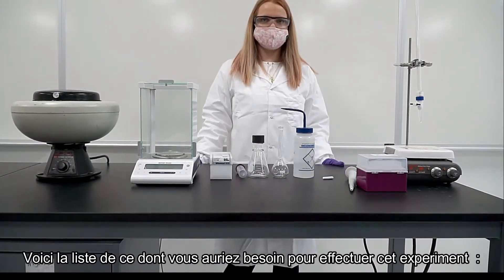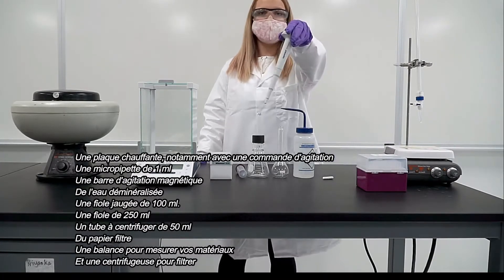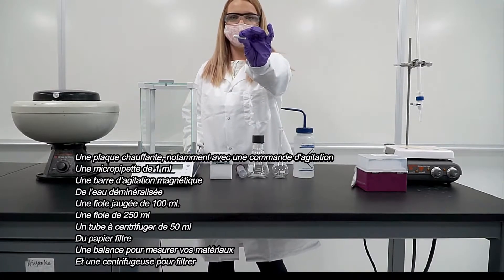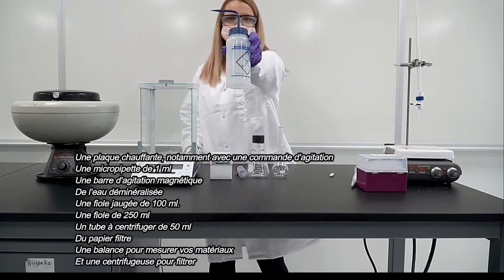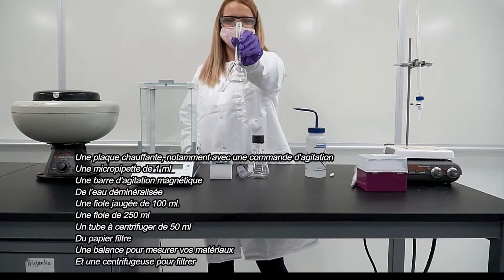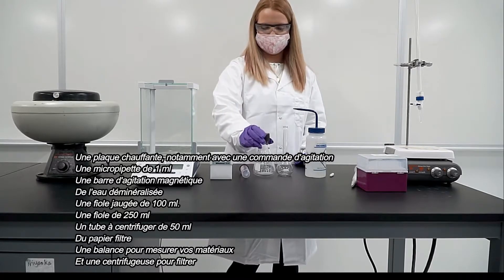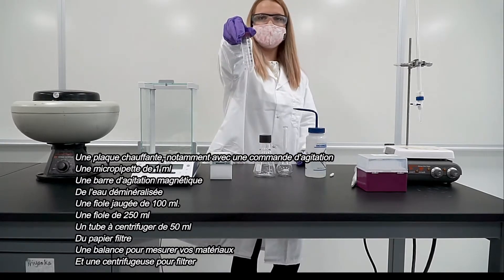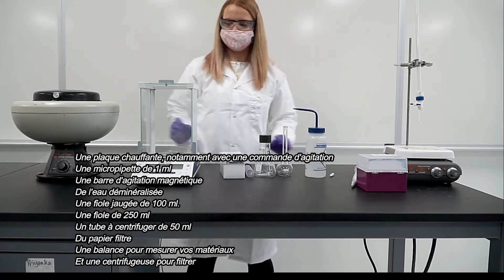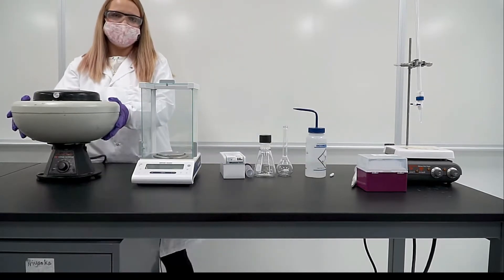Here are some of the supplies that you will need: a hot plate specifically with stir control, a 1 milliliter micro pipette, a magnetic stirring bar, DI water, a 100 milliliter volumetric flask, a 250 milliliter flask, a 50 milliliter centrifuge tube, filter paper, a scale for measuring your materials, and a centrifuge for filtering.